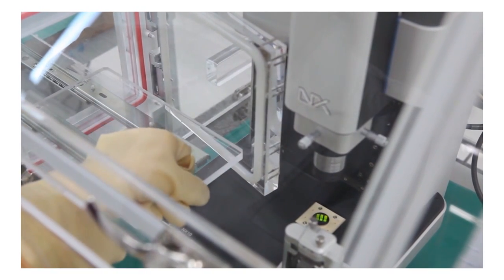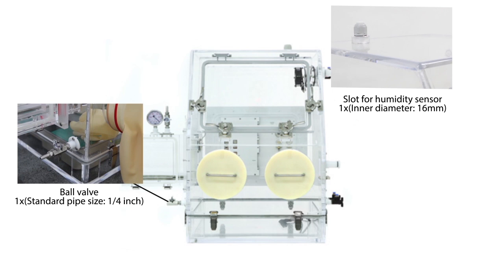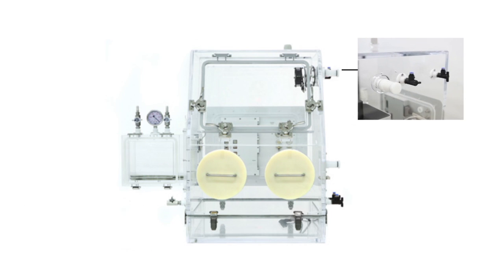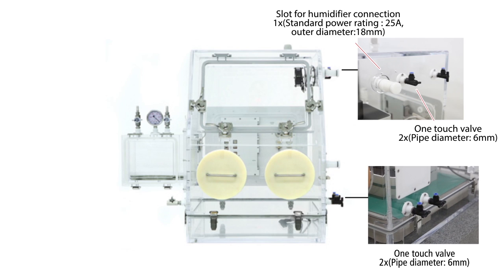A slot for a humidity sensor attachment can be found at the top of the main chamber, and a safety valve for gas pressure adjustment is located on its bottom left side. Additional valves for humidity control are located at the top right, and gas intakes on the bottom right.